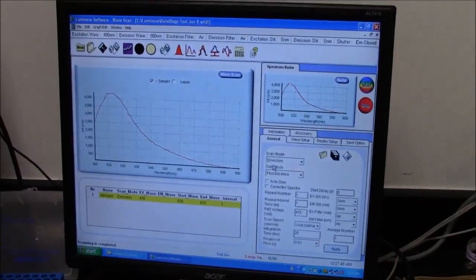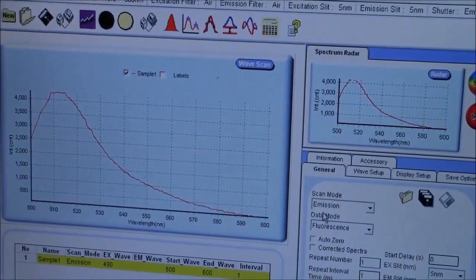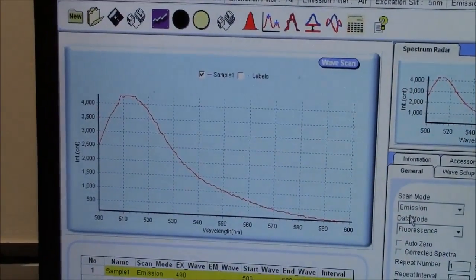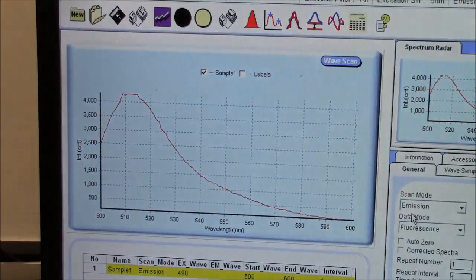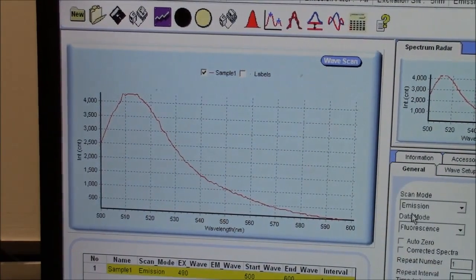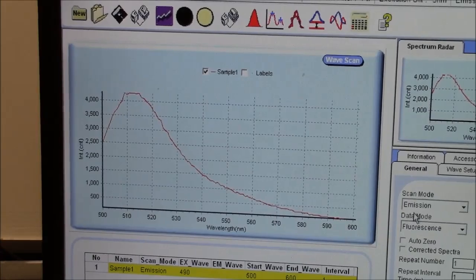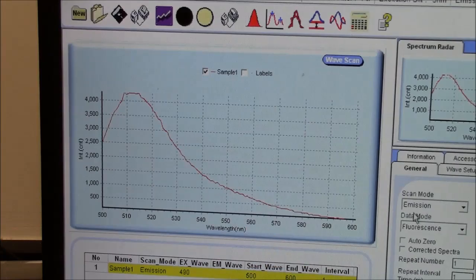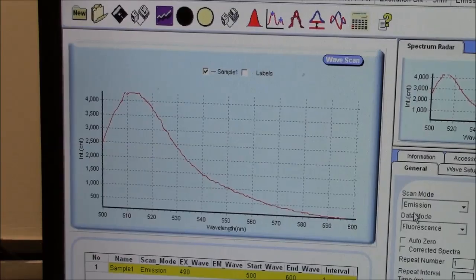We can see here that the peak emission is close to 510 nanometers, between 510 and 520 nanometers. By the time we get out to 600 nanometers, there is no light of that color being emitted. So this is in the green, and then this is the yellow over here, and this would be getting out to the orange. So we're predominantly green in color, and that is the fluorescence spectrum from my sample.